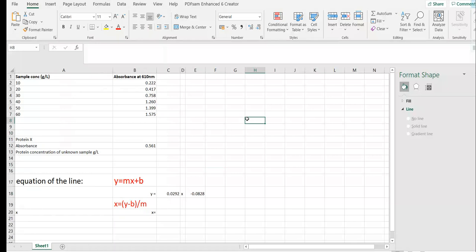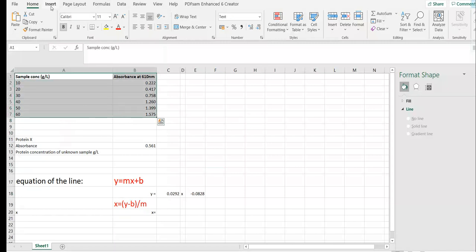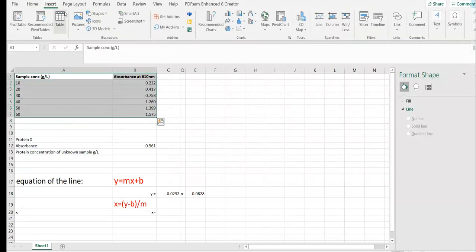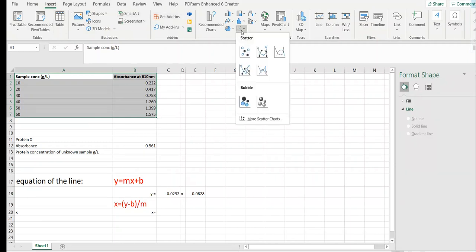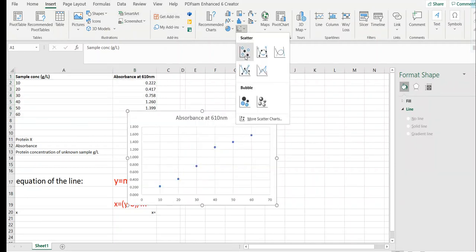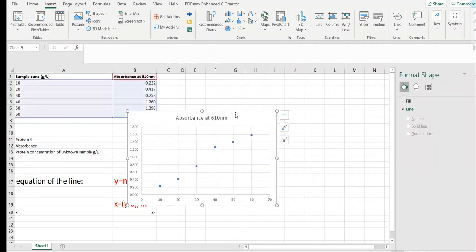So here is an example, protein concentration found in grams per liter and absorbance at 610 nm. The first thing you need to do is select all these values, go to insert and select a scatter plot.